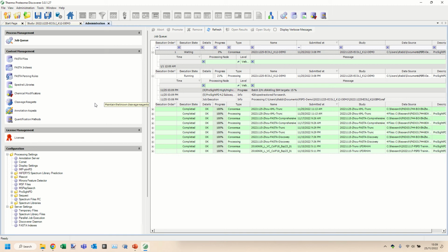And I wanted to note that the great majority of the time that these searches take for me come from deconvolution. So you see that crawling, however it should be properly pronounced, crawling is this process by which the software looks for spectra that are appropriate for search. In other words, tandem mass spectra.